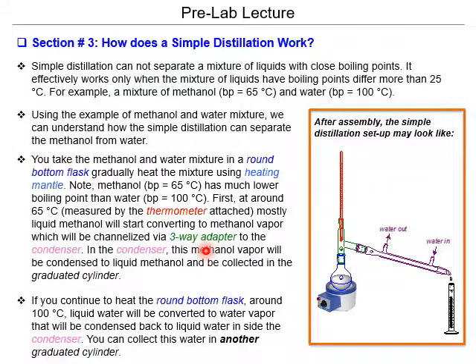Sometimes you have a thermometer which is far away from the heating source, right? So even though the mantle might give you a temperature, the thermometer might give you another. So you always want to keep these approximations in mind, and always note them in your lab notebook, right?